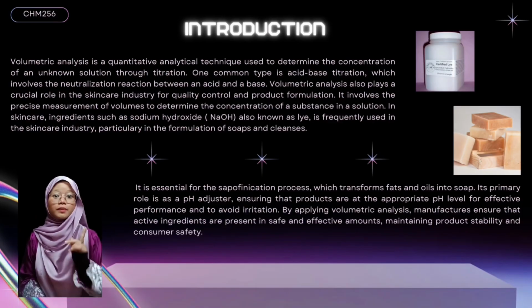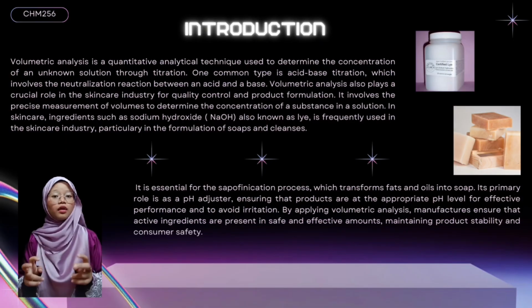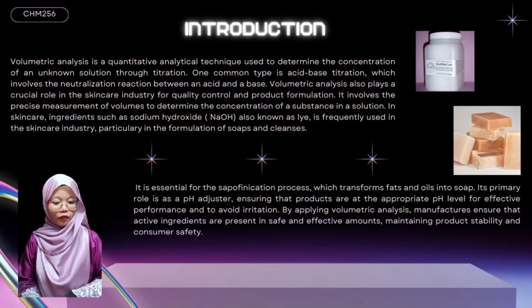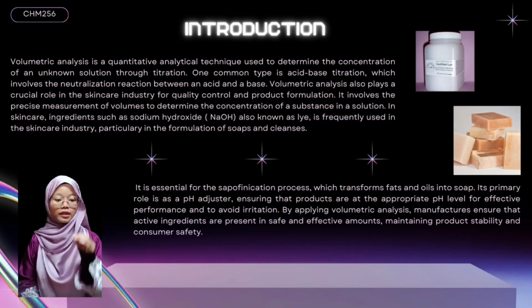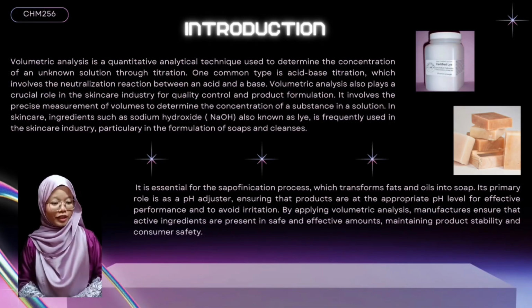In this presentation, we will also be talking about the application of acid-base titration in the skincare industry, because it involves precise measurement of volumes to determine the concentration of a substance in solution, and also for quality control and product formulation.